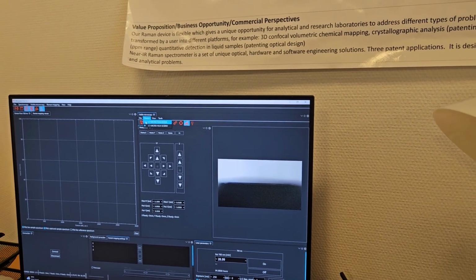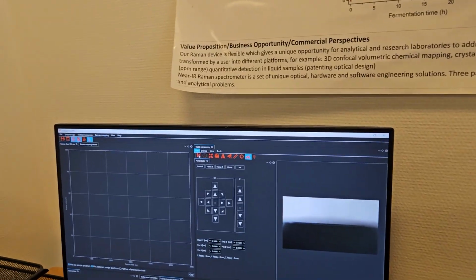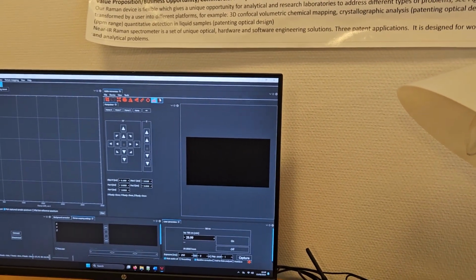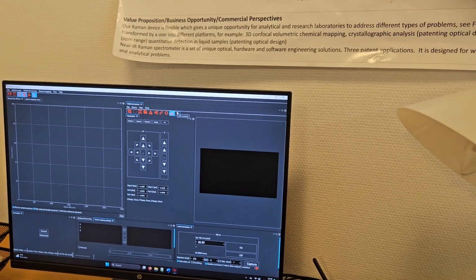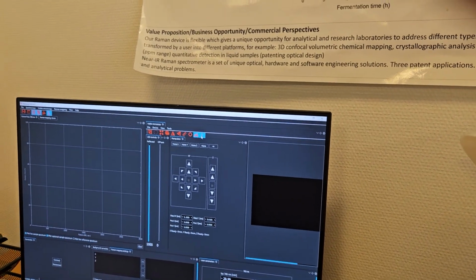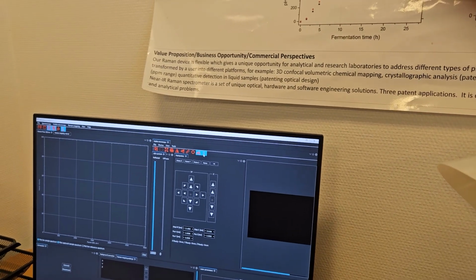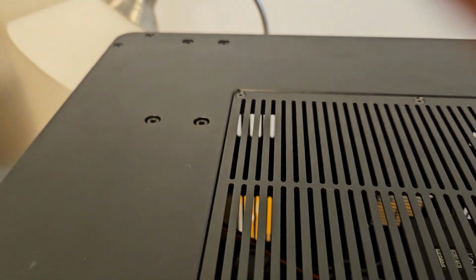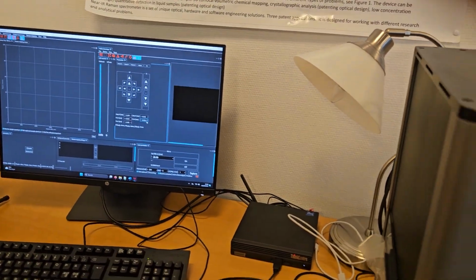We choose the proper device and file, start camera. Now we have the proper camera, and then it's far away from the device, and now we have to switch LED controllers as well. LED control, LED is on full power, LED is on top over here, and then we'll focus on the sample.